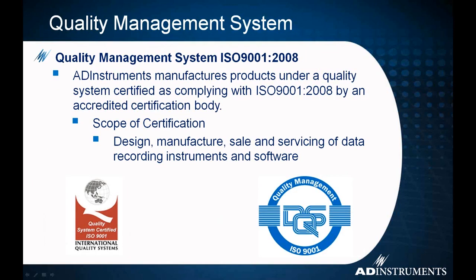Another question we get quite frequently is, how do I know what I'm getting out of PowerLab and out of LabChart is accurate, and what really is being input to it? AD Instruments spent a considerable amount of money and time to get certified with the quality management system ISO 9001. They go through and look at our validation, manufacturing, and testing procedures so that we know it's validated, and we can guarantee that what you're seeing in the software is what's actually being input to them.